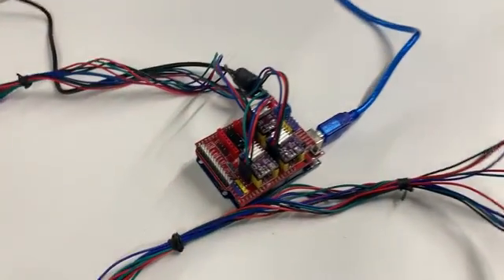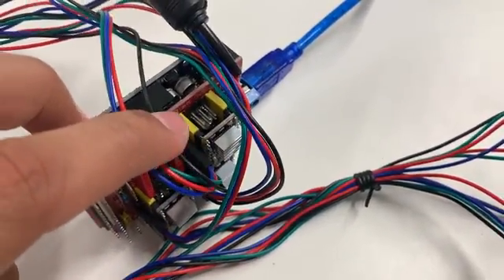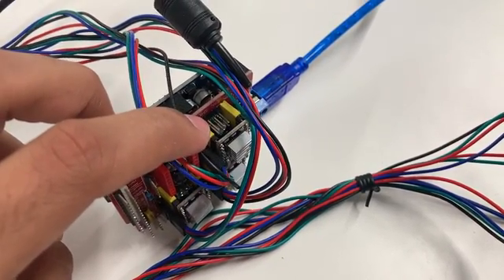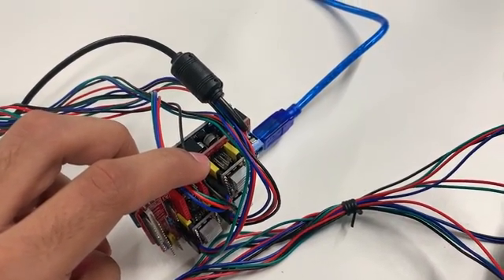The very first thing we want to do is make sure that we have the appropriate microstepping enabled on our board. If we look here, we can see that in my case I'm using one microstepping, but if you were to use different jumpers on the different pins, you could have one over two, one over eight, et cetera. You can look at the Palolo documentation for that.